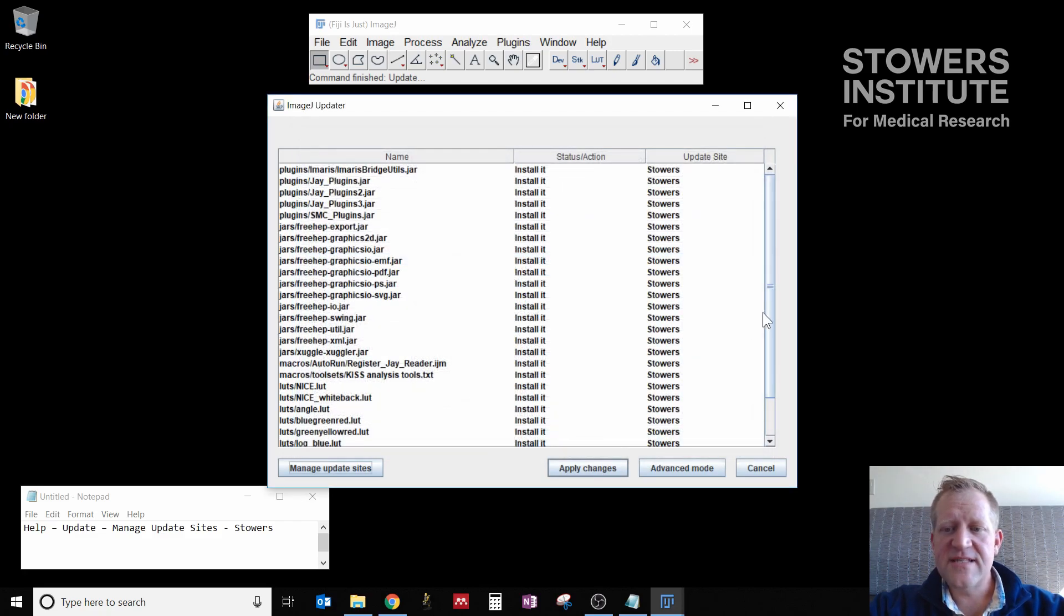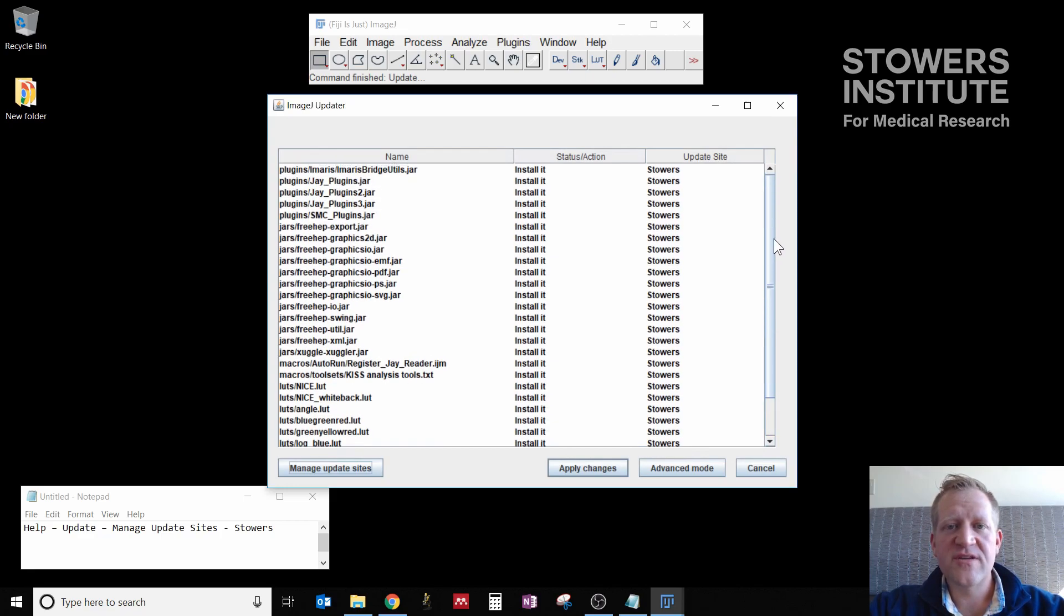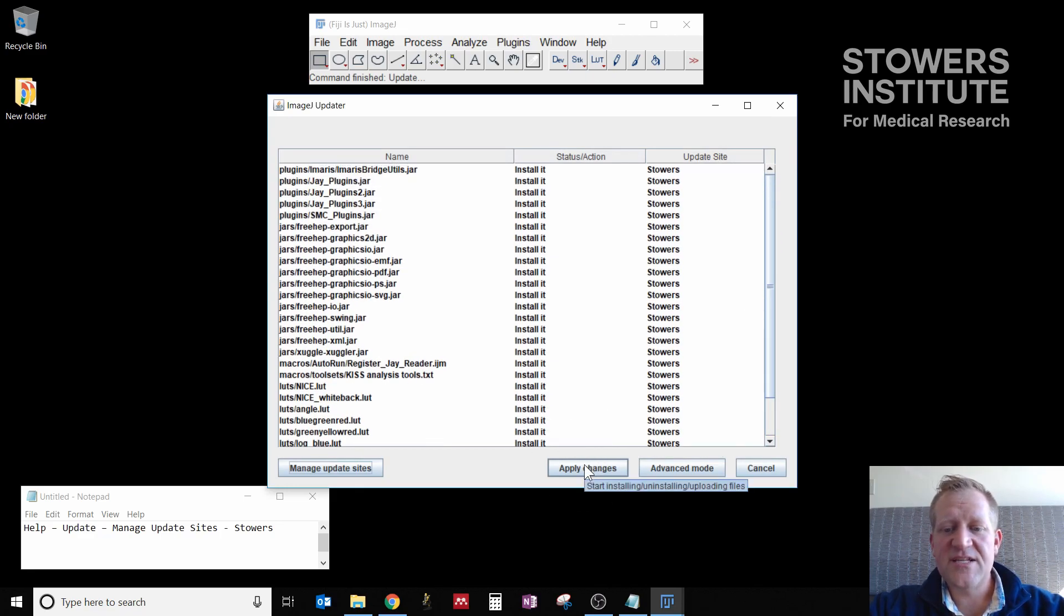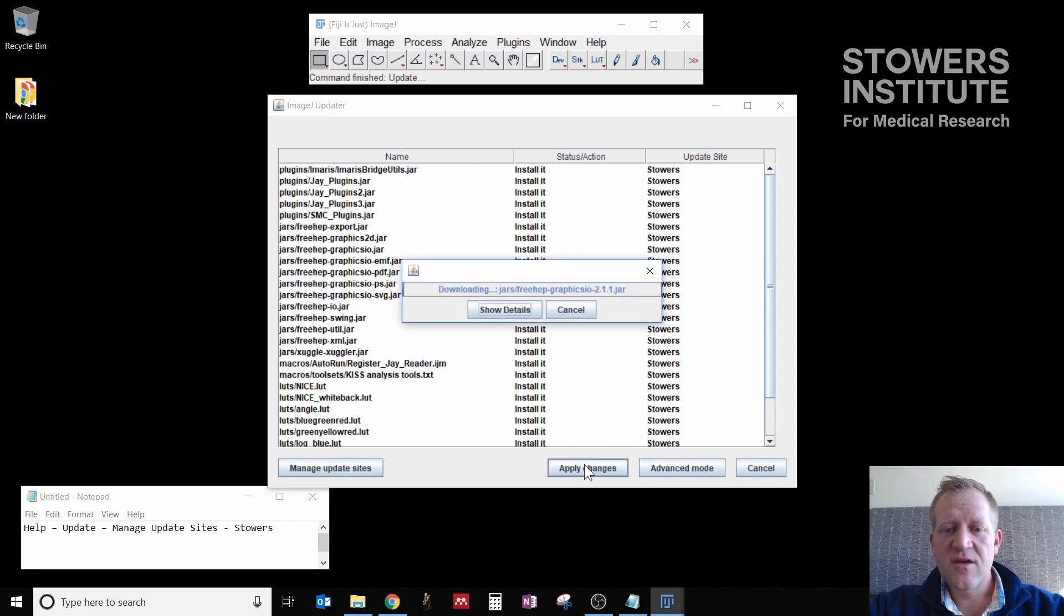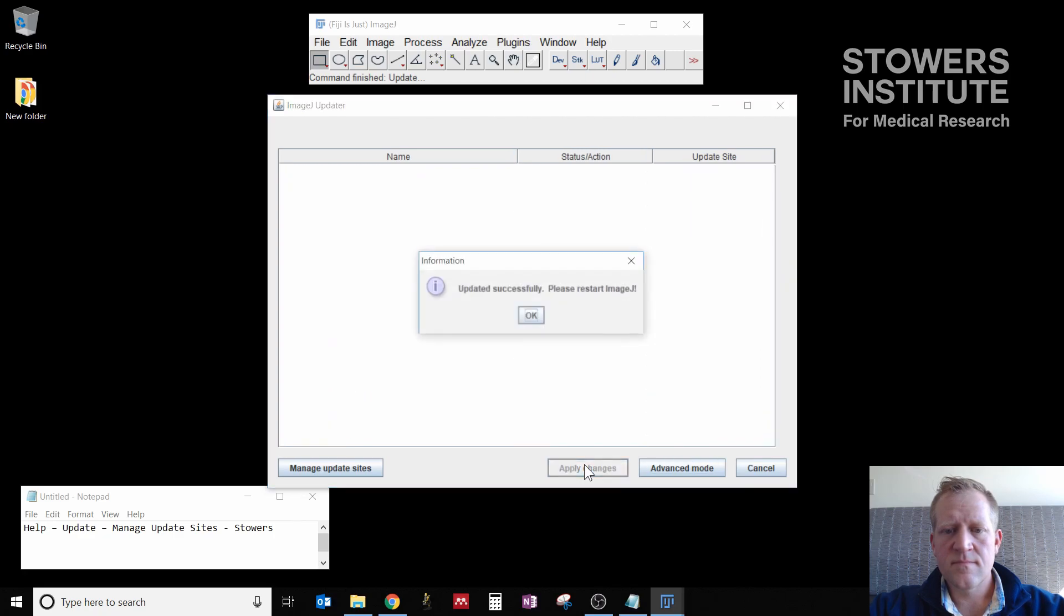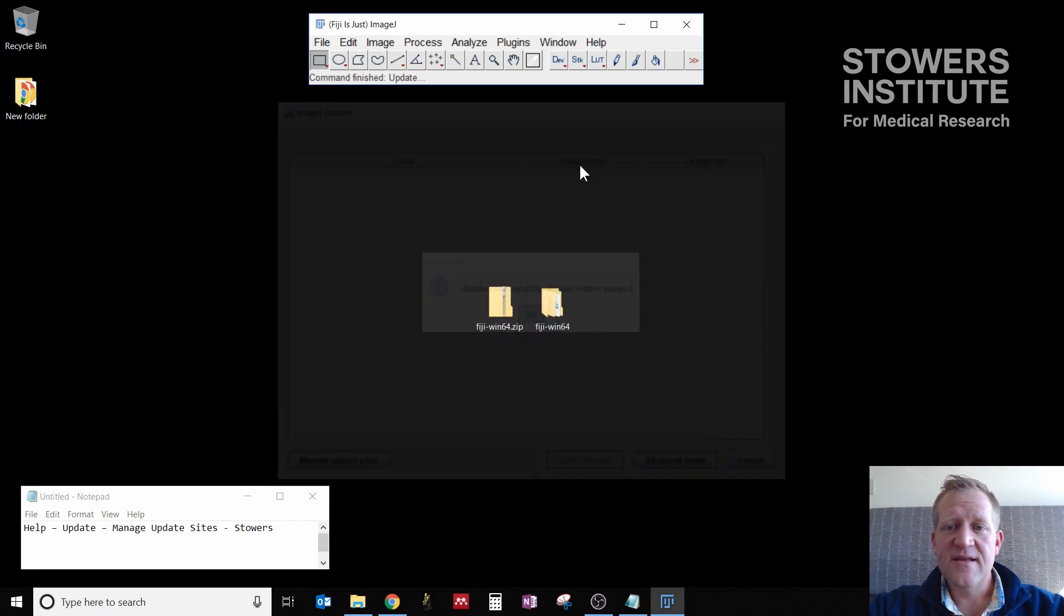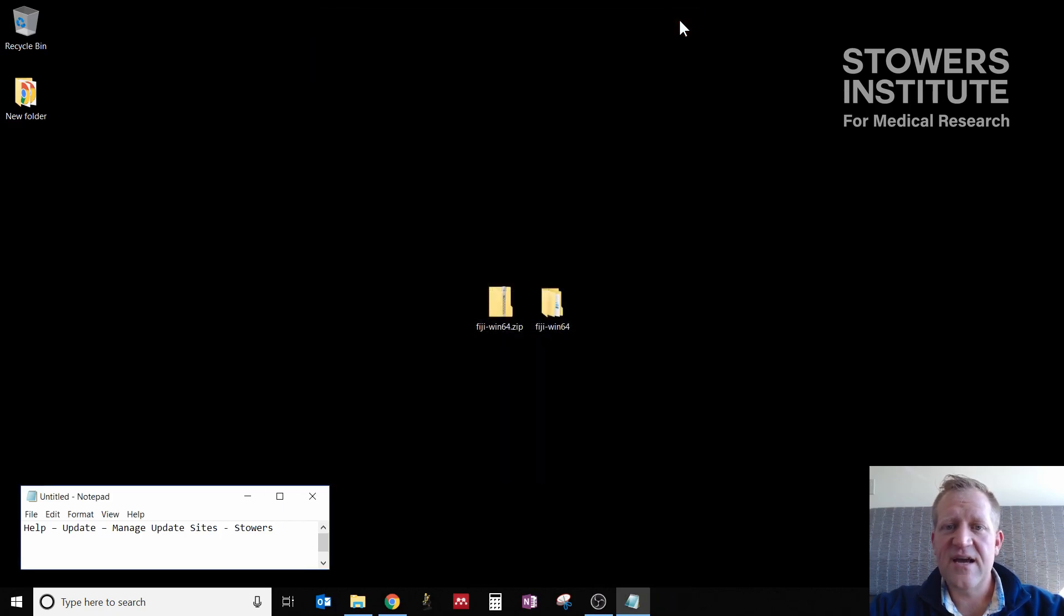Once I click that checkbox, I now counterintuitively click Close. And you'll see this window is now populated with a whole host of plugins that we're going to install. Clicking Apply Changes will go through and install all of those plugins.